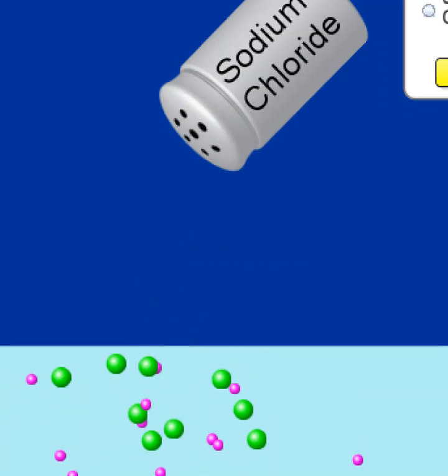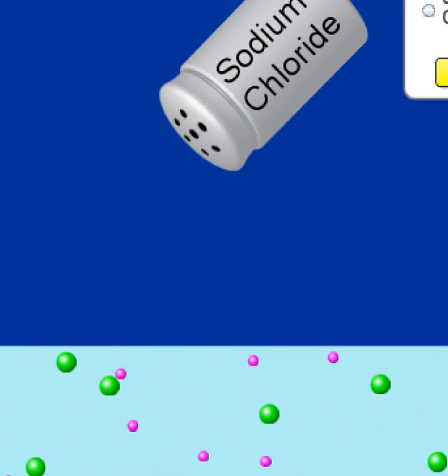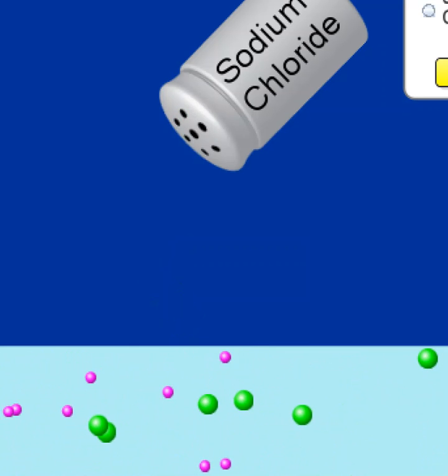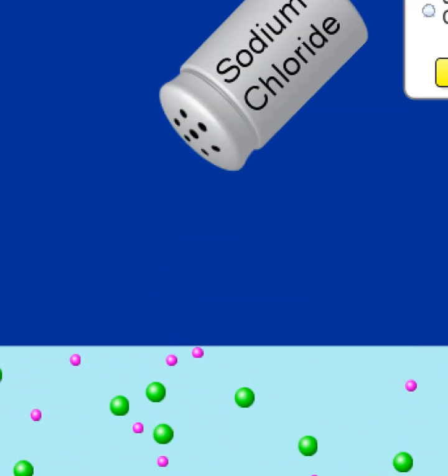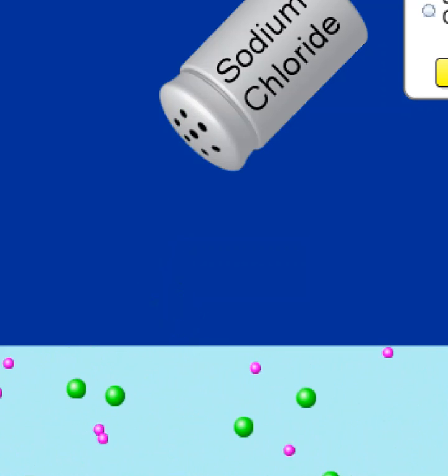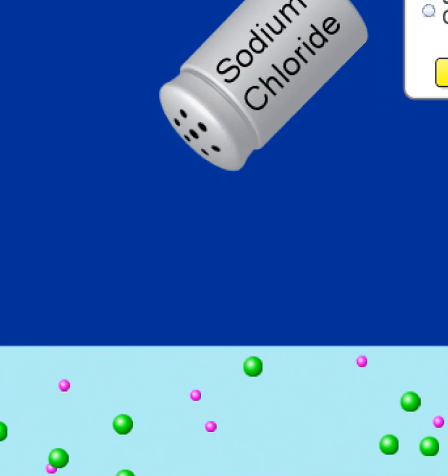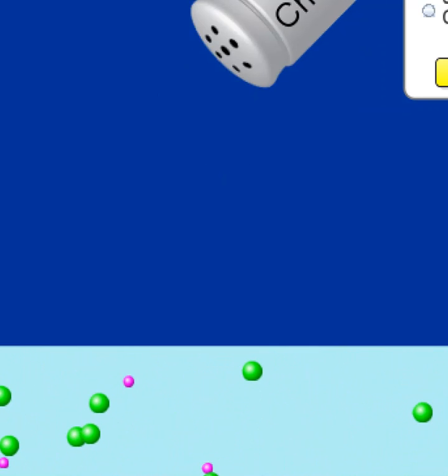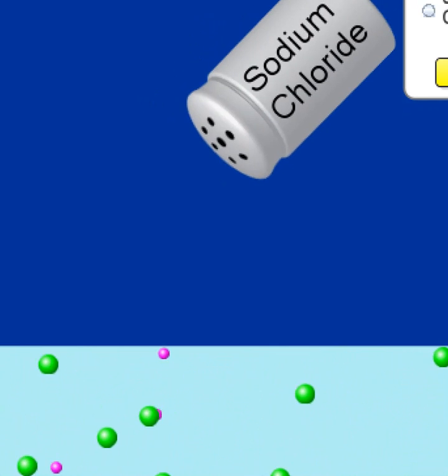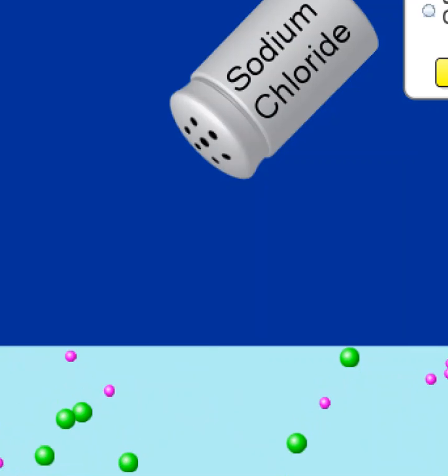They break apart. And some of them are floating off the screen there, but those particles are the ions, and so we have a bunch of charged ions floating around in solution, and that is the key to conducting an electrical current, is to have ions floating around freely in the solution. And the more salt I put in there, the more ions I would get.